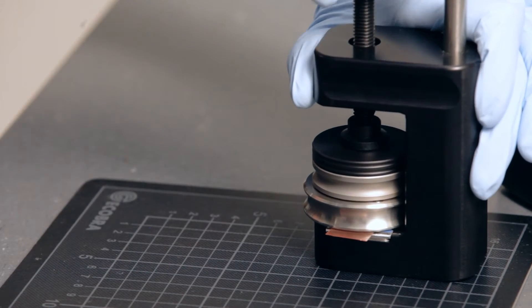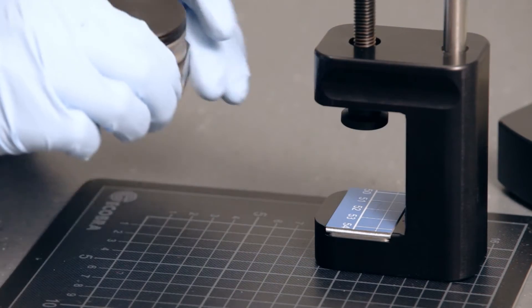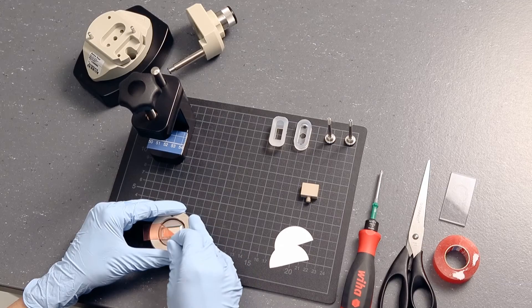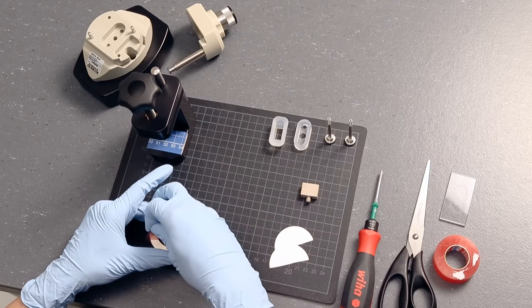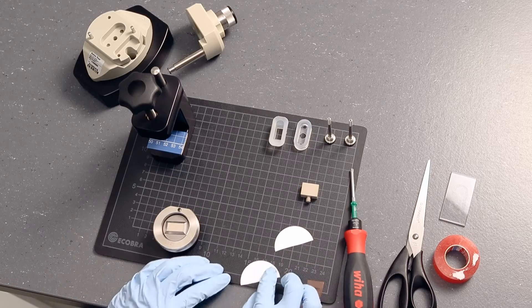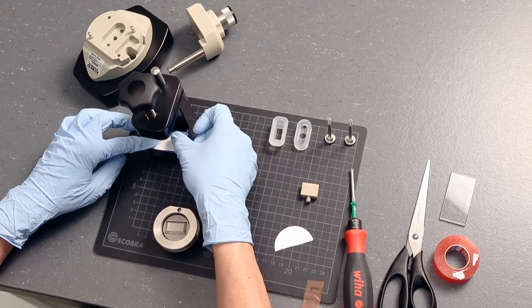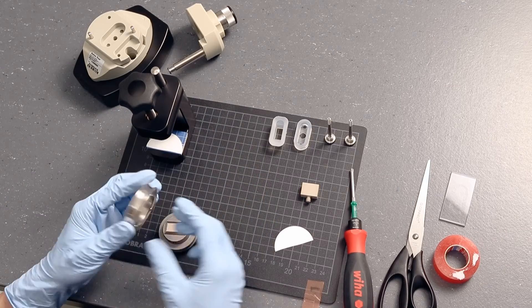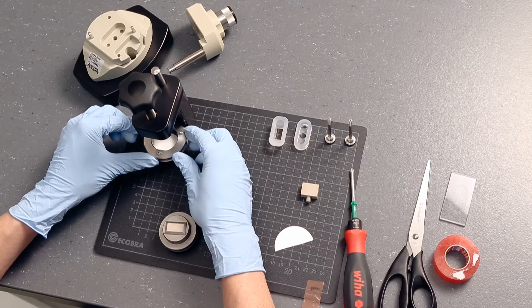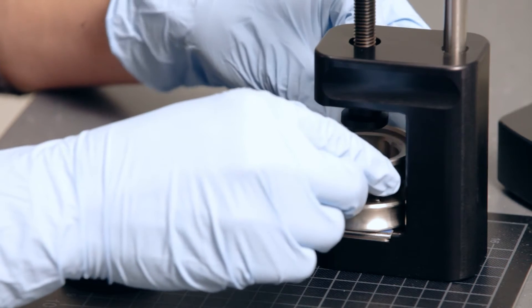Remove the puncher with the sample holder and the excess adhesive tape. The back side of the membrane sample has to point upwards. Place the stack of puncher and sample holder onto the membrane sample.